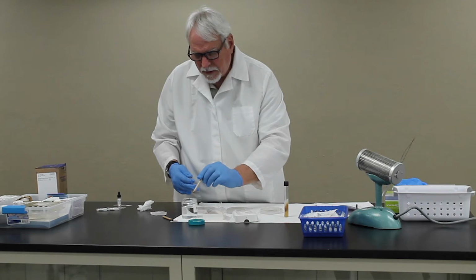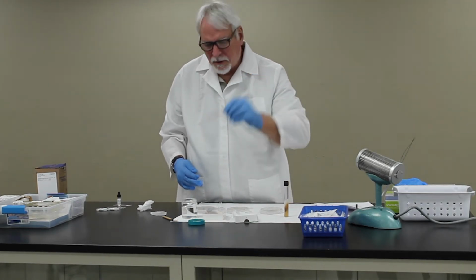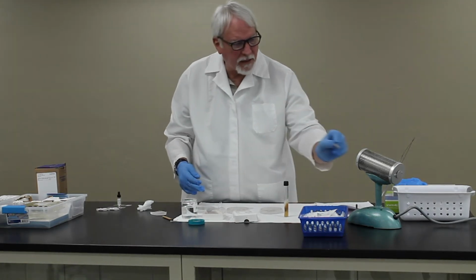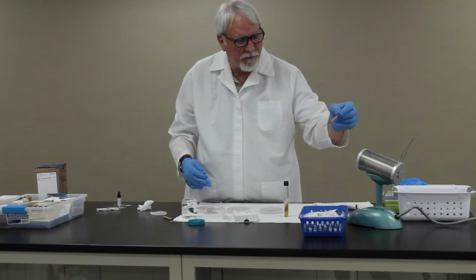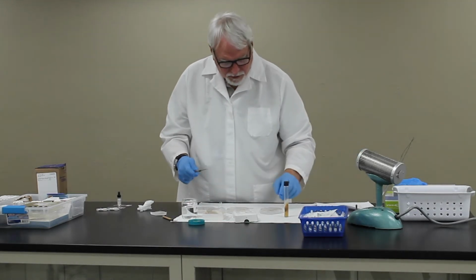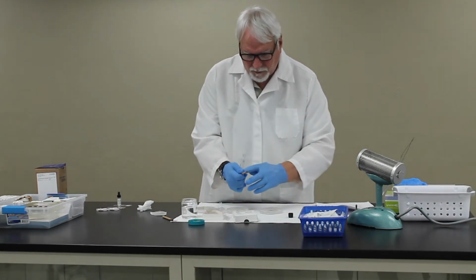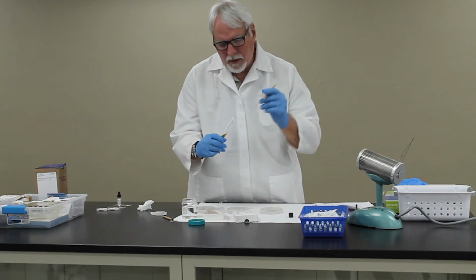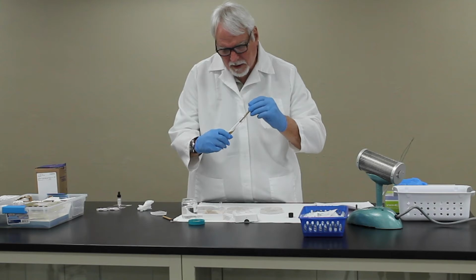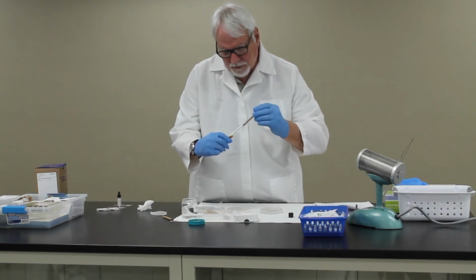So we want to dip your crooked needle here, your little tool that we've made to pick it up, and you're going to pass that into the flame until it catches on fire. And when that burns off, then you're able to do your transfer. So to do that, we're going to reach into the tube and we're going to pick up a plug of that agar that contains some of the fungus on it.